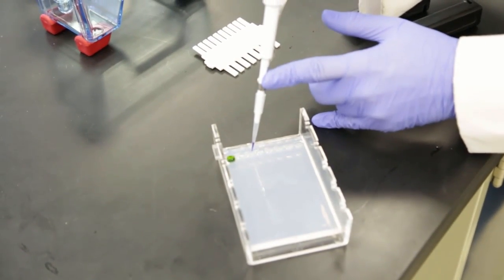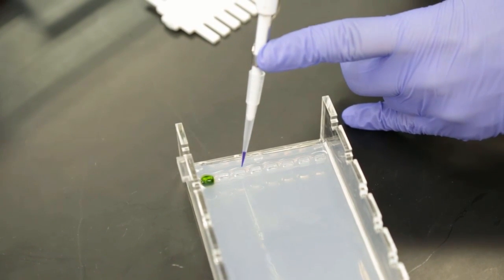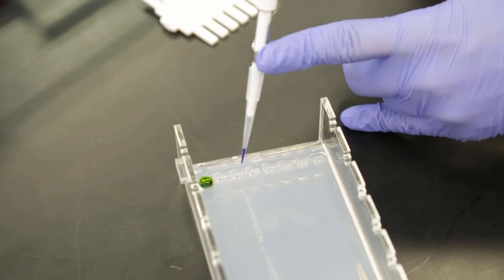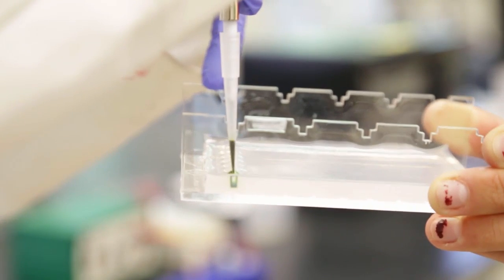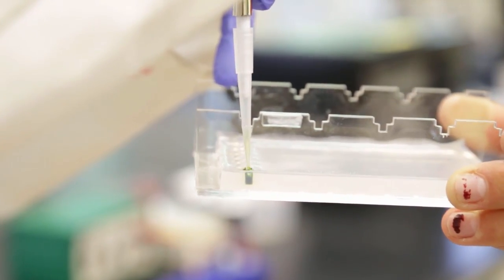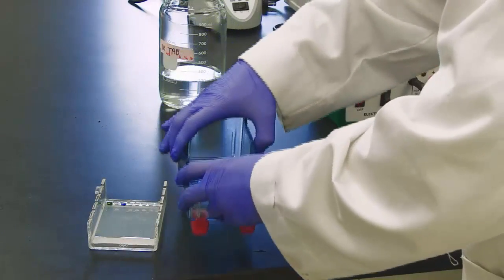So I want to put the pipette tip just at the top of the well here. You don't want to go and stab the gel, otherwise then all the DNA will go out. So just at the top of the well, and then we pipette in. My DNA has now been loaded. Now I can put it into my gel box.